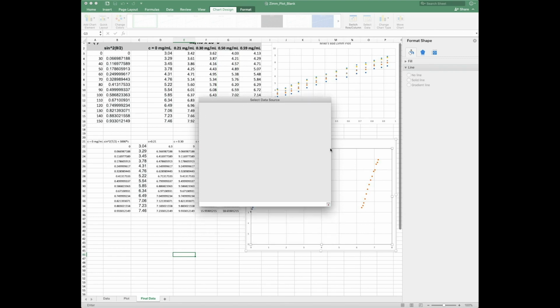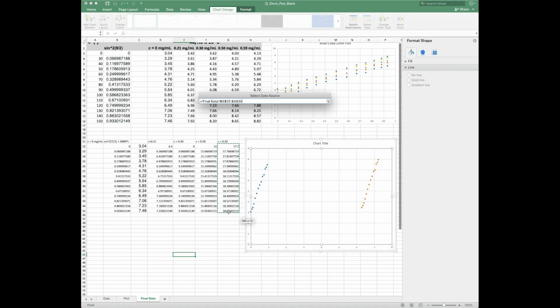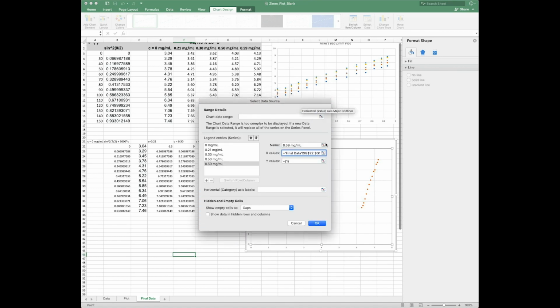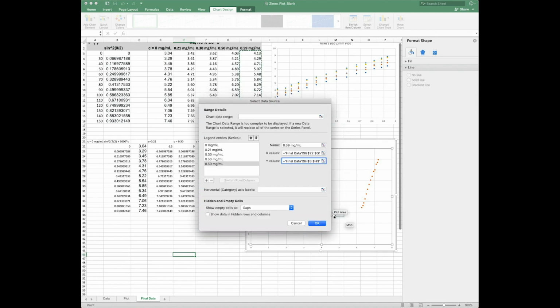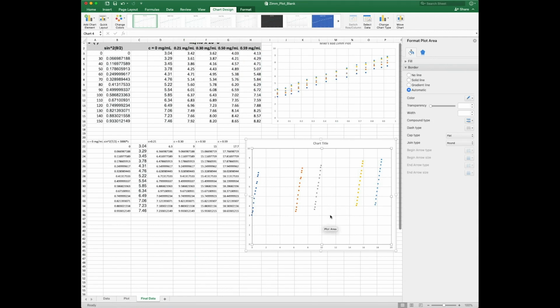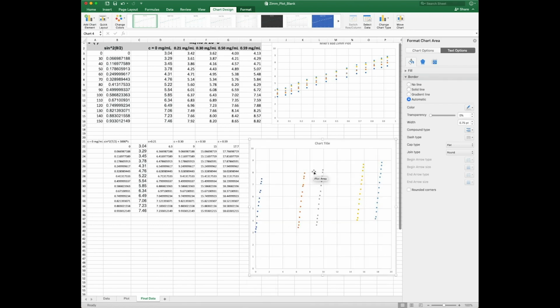As I'm doing this, I'll just say that, again, in the real world, the instruments these days will make the Zimm plots for you, but it's really instructive to see what they actually are, because just plugging into an instrument, just saying, oh, well, the instrument told me that this is the number, this must be the molecular weight or whatever, that's really dangerous. You can get into a lot of trouble that way. So I really encourage you not to do that, and that's why we're going through the Zimm plot like this.